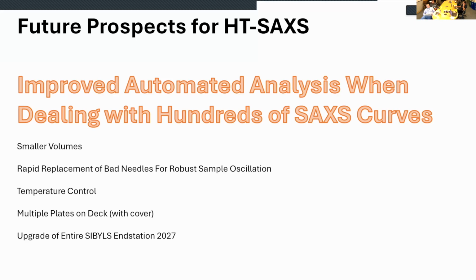So we can now collect at 4 degrees and collect at 80 degrees next. We can go quickly between the two. We can also do ramping of the temperature while the needle is in the sample cell place. So we can look at the temperature SAXS of, let's say, several mutants or metabolites or things like that. That's already in place, but we've only had one example of it so far.